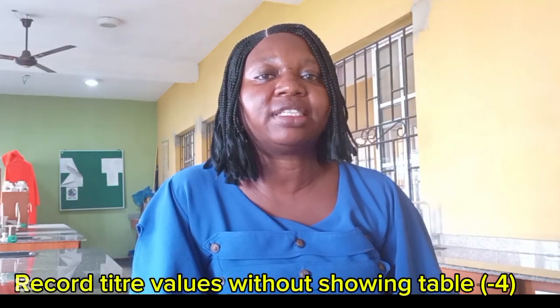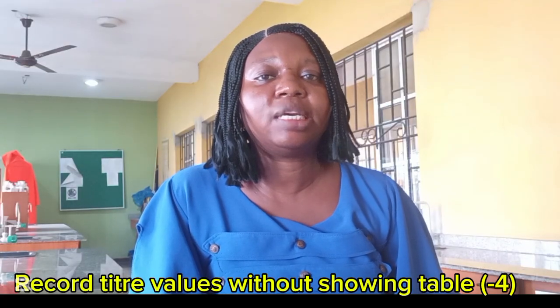The next thing that can cause your mark to be deducted is if you put your average titre value without showing the table where you got it. You are going to lose 4 marks. That means you just got the titre value from somewhere.